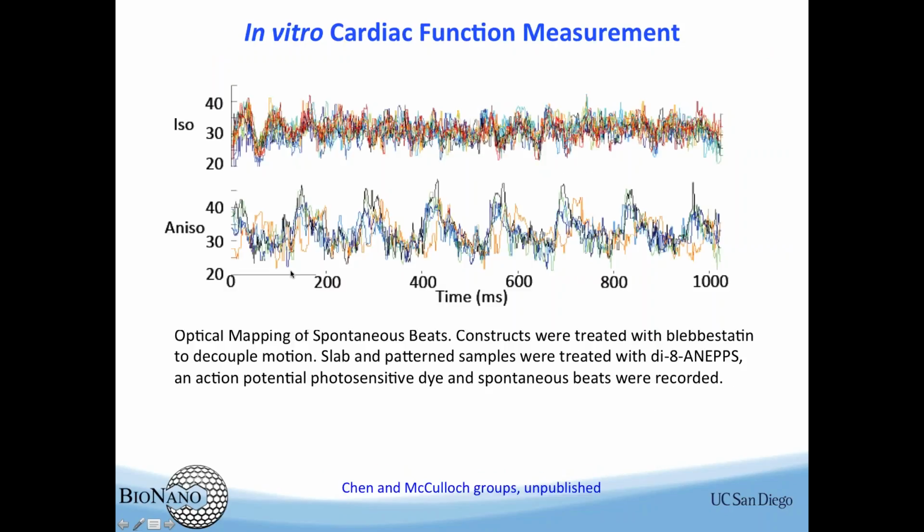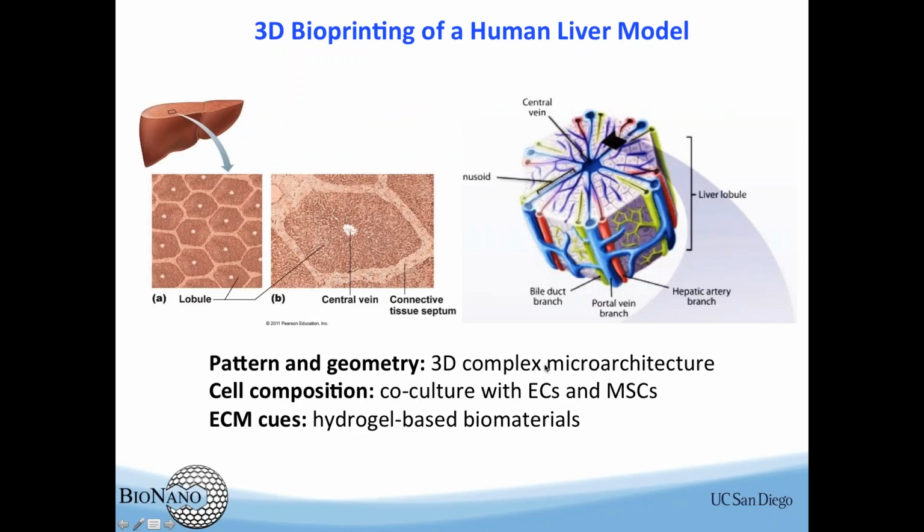Okay, and this so-called optical mapping shows the difference in terms of the magnitude and the frequency of the beating.